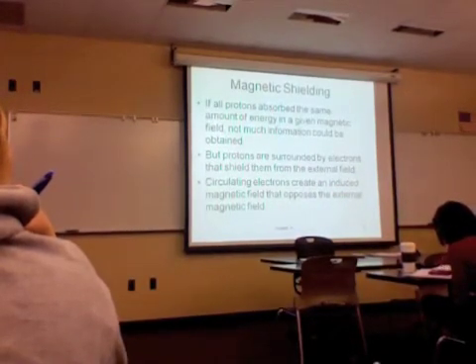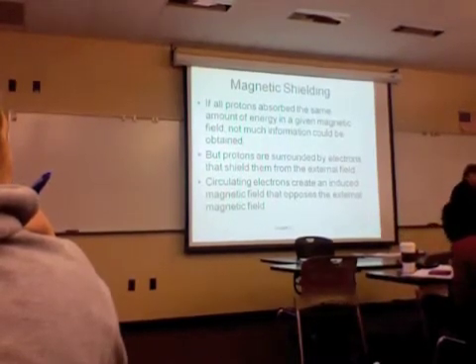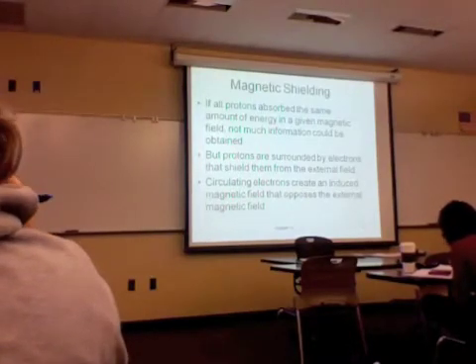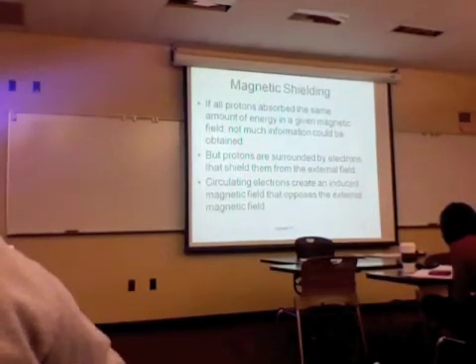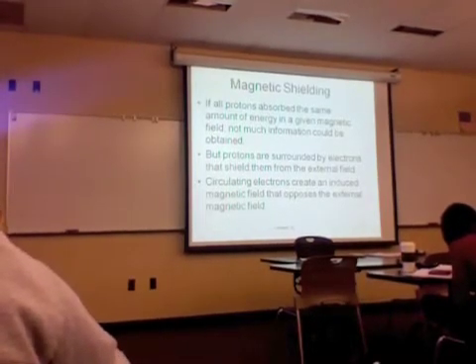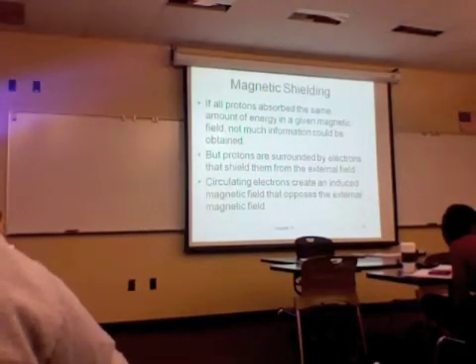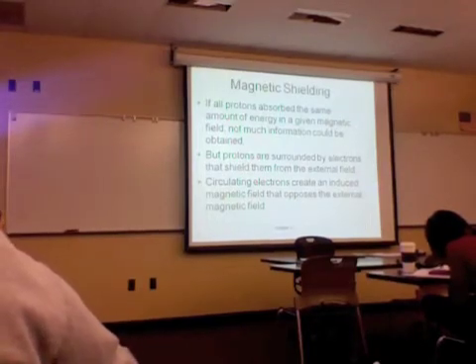Now, if all protons behave the same, this would be a really expensive proton detector. But fortunately, they don't. The electromagnetic environment of the protons affects where they resonate. And what do I mean by electromagnetic environment? Light? Or it refers to the electron environment around them.